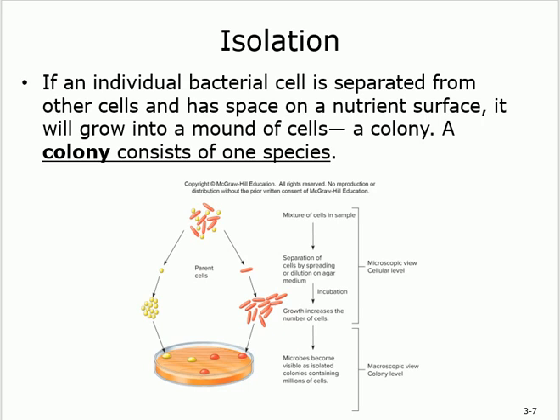So if that's the case, what's a colony? The colony is one species only. What's the difference between that and pure culture? You have several colonies. Okay? Each one colony represents one species.